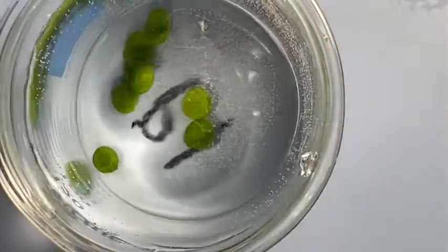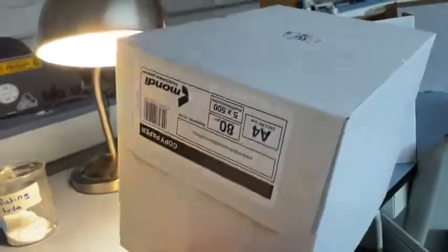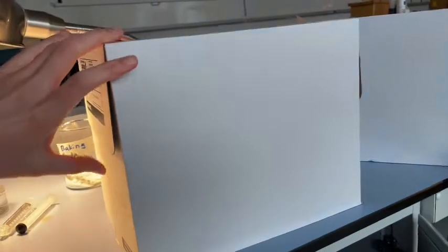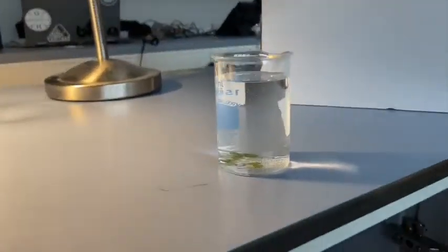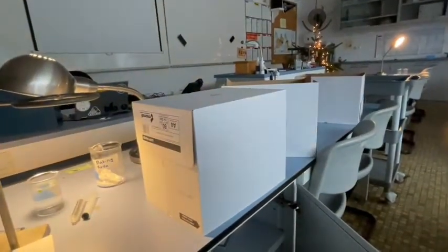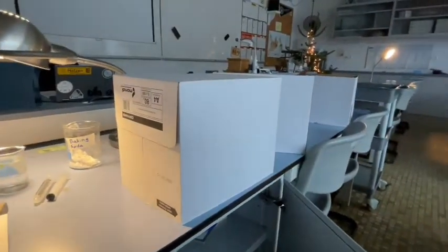All right, so this is my dark experiment. It can be happening at the same time that the light one is. So maybe they can just have a box that they put on top, sorry, get that lamp out of the way, so it is completely dark over that, and then every minute lift it up, see what it's doing, and then place the dark box back on. So you have a dark box and a light box. Usually I don't use the light box for the dark box, like I don't have them use the same one and then turn it back over again, because that would take 30 minutes. It would take double the time.